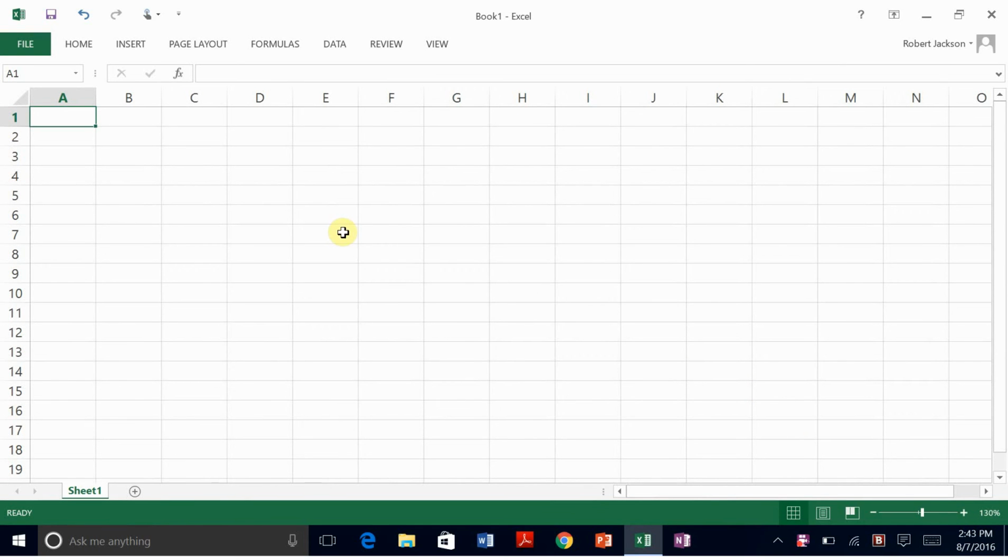Now, the first thing we're going to do is to get the calibration curve for the spectroscope. When you do that portion, you'll be taking spectroscope readings, which will be in arbitrary units 0, 1, 2, 3, all the way up to about 12. And those will correspond to specific wavelengths of your helium calibration lamp, and those will be in nanometers.